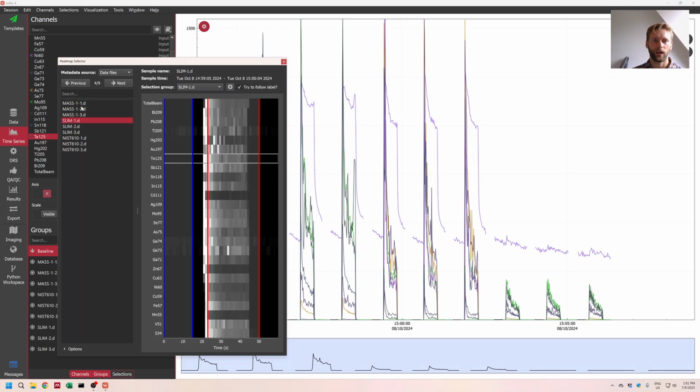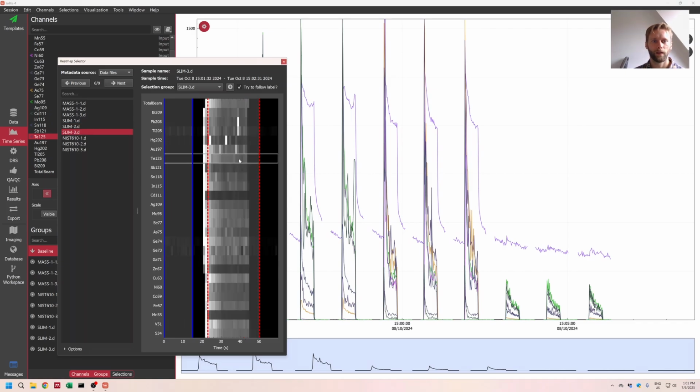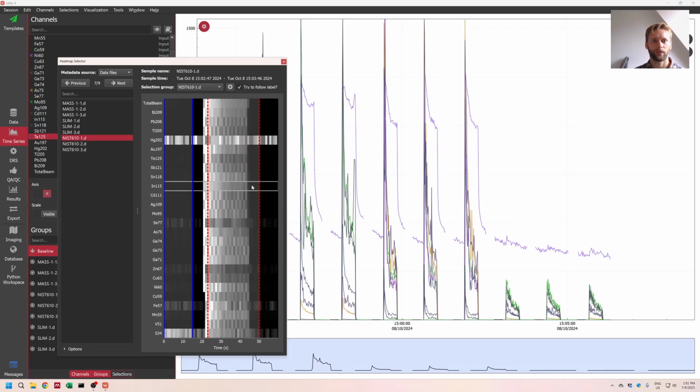And so you can go down and press Control to select where you want the peak to be, like this. You can go in and fix these other ones like that, right?